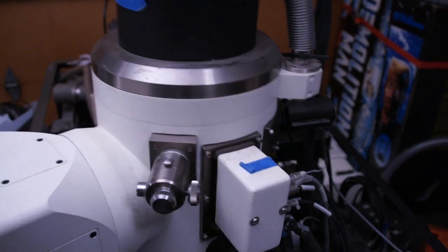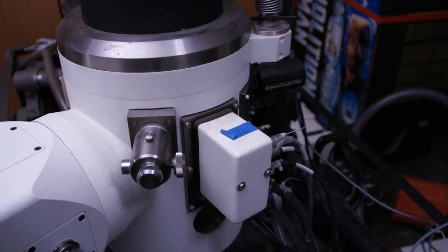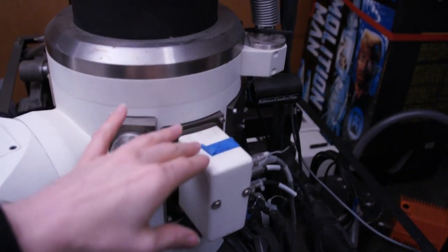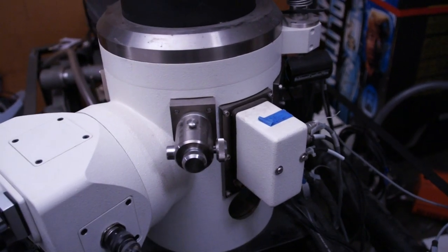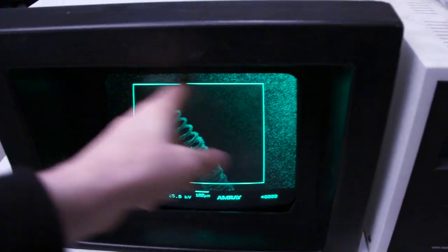This is one of the detectors. I have a couple others that aren't installed on it right now. This particular detector uses a scintillator, which when the electron strikes it, it gives off a little glint of light, and then behind the scintillator is a photomultiplier that multiplies that signal up to a point where the console can determine if it's a bright or dark spot, and it'll draw the pixels on the screen.